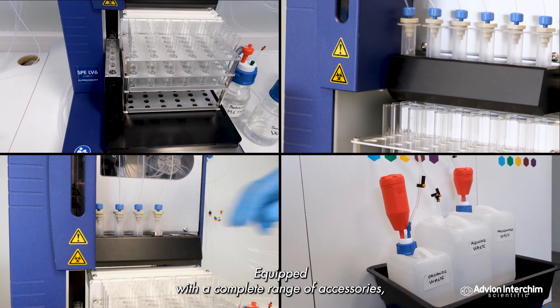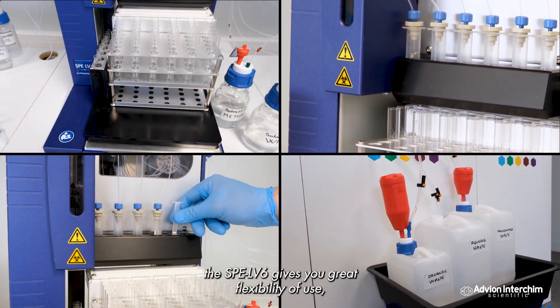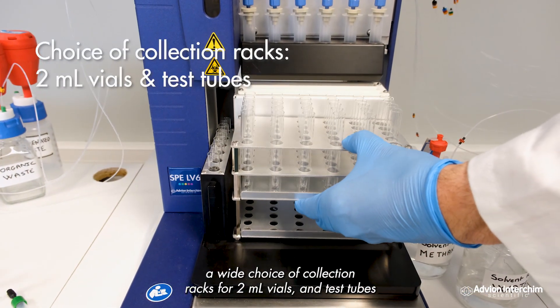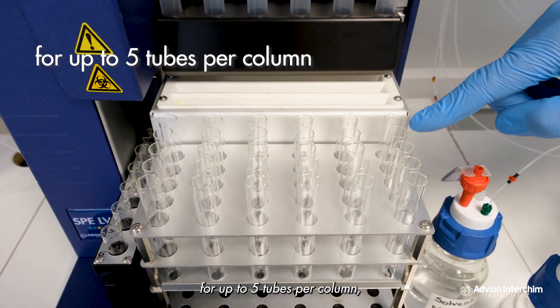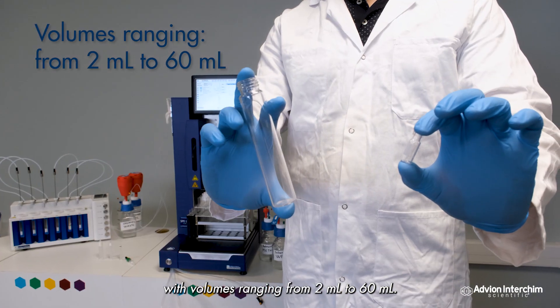Equipped with a complete range of accessories, the SPE LV6 gives you great flexibility of use. A wide choice of collection racks for 2 milliliter vials and test tubes, for up to 5 tubes per column, with volumes ranging from 2 milliliter to 60 milliliter.